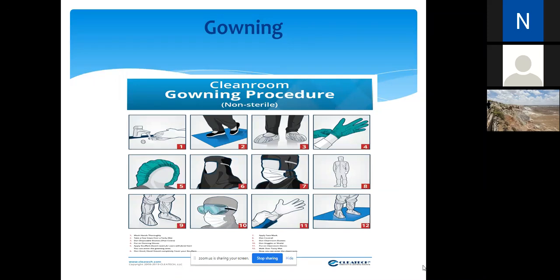If you want to take your phone or anything outside of the clean room into the clean room, it has to go through a process where you clean it with isopropyl alcohol and get all the different contaminants off. If it's a chemical you're bringing in, you have to make sure that it is cleaned properly.